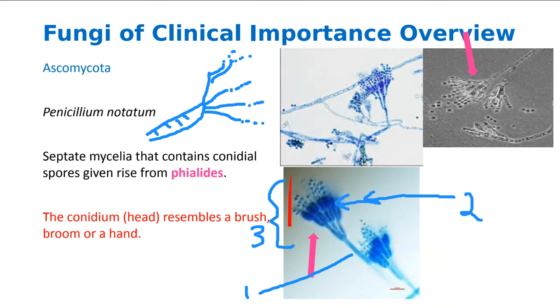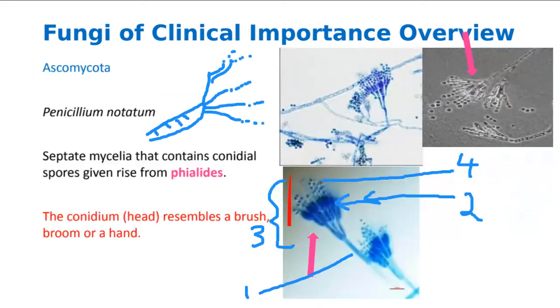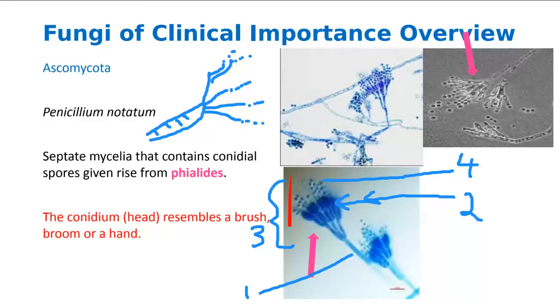And then what are these little round structures here? Spores. Very good. So now you know, right? And so if we think about that for just a minute, here you can see one that is not stained, and they're harder to see. And so we stain them to make them easier to see. I'll make sure that I use a really good image when we have a practical.